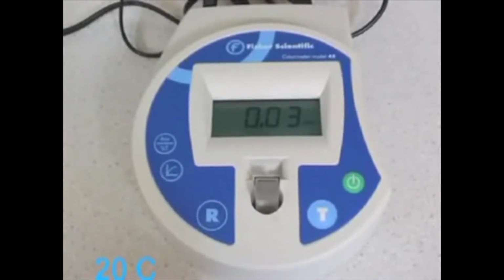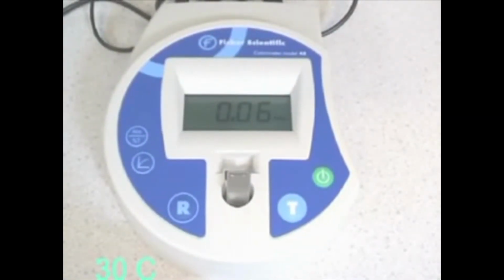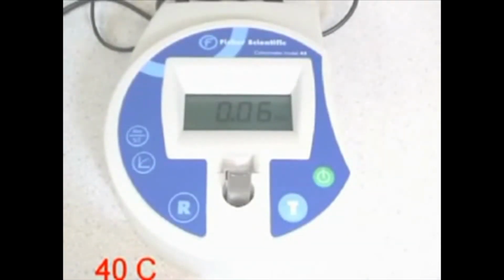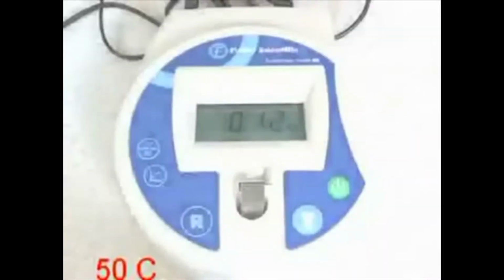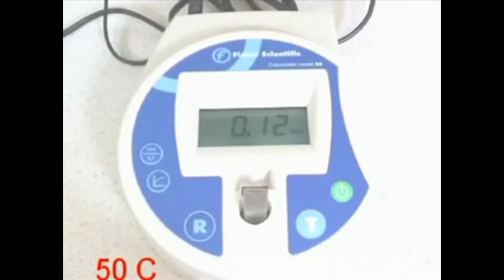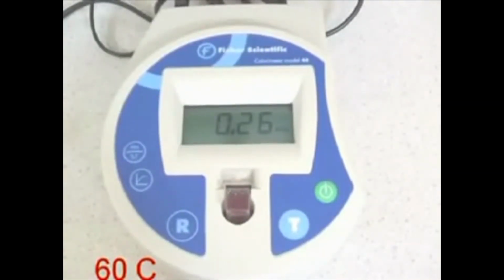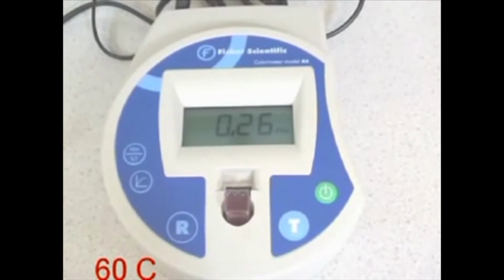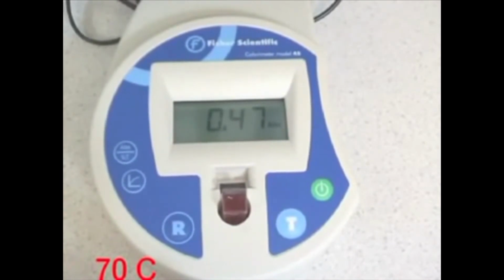At 0 and 10 the absorbance was 0, at 20 0.03 units, at 30 0.06 units, at 40 0.06 units, at 50 0.12 units, at 60 0.26 units, and you can see if you look at the cuvette it's clearly purple, whereas up until now they've been barely discernibly anything other than clear. At 70 0.47 units.